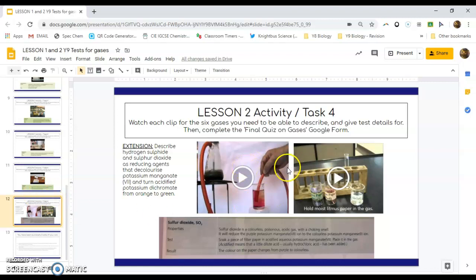I've put 2 videos for the extension students. I've also thrown in another gas that you might want to learn about. So for the A-star students, that should stretch you. Learn about hydrogen sulfide, but treat the testing as if you are testing for sulfur dioxide. It decolorizes the purple potassium manganate solution. Also, learn about acidified potassium dichromate going from orange to green.